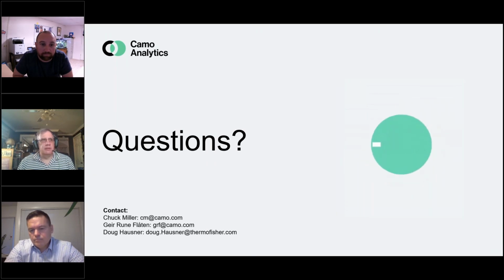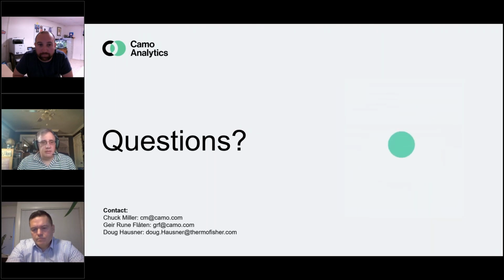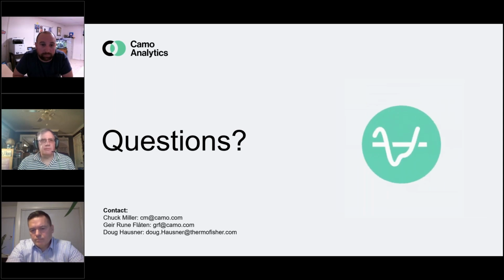Chemistries that are very exothermic, and I know you mentioned that previously, but that was one of the benefits that I thought was really important to bring out. There are some chemistries that are very, very difficult, and you can bring access to them in a business sense through these continuous systems and through these highly analytic platform technologies.